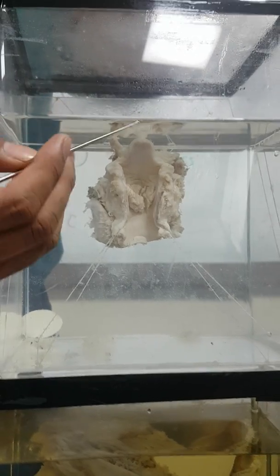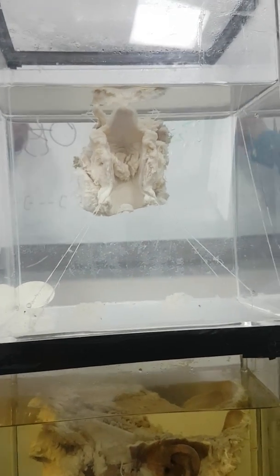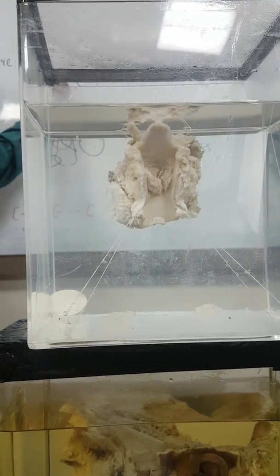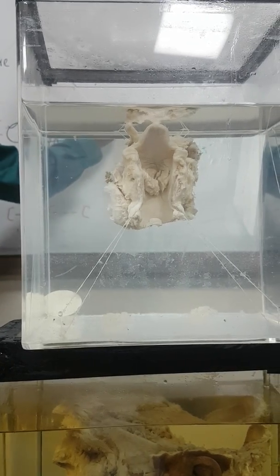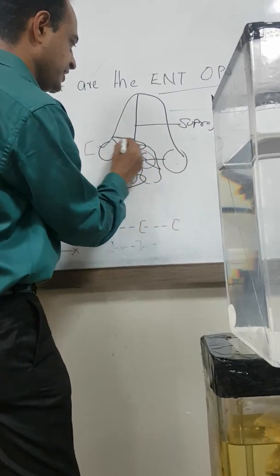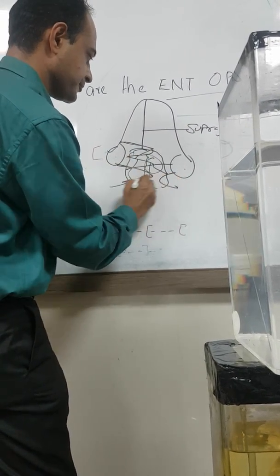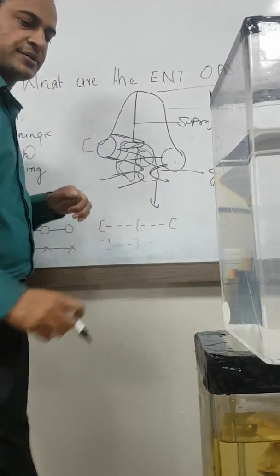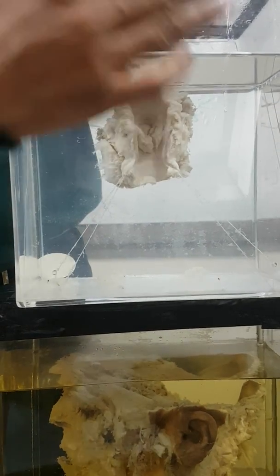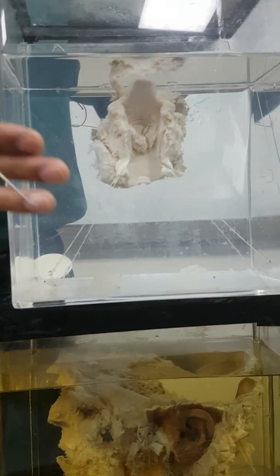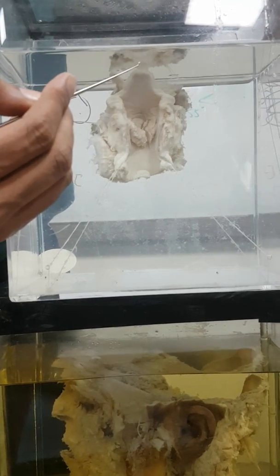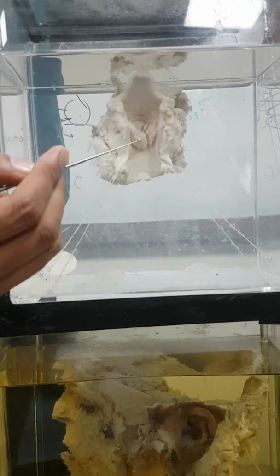From the epiglottis, you cannot clearly see here, but there will be a false cord and a true cord. From the epiglottis to the false cord, this is the supraglottis. Between the two true cords is the glottis, and below this is the subglottis. So: supraglottis, glottis, and subglottis.